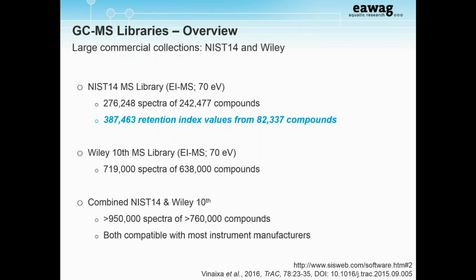There is also a much larger collection, the Wiley 10th. I've never had the pleasure of owning this collection. It has about 700,000 spectra of around 638,000 compounds. You can also purchase these collections combined, and together that will give you not quite 1 million spectra, but you're getting close. Both of these are compatible with most instrument manufacturers, and this is usually the way that most people use them, basically through their vendor software.